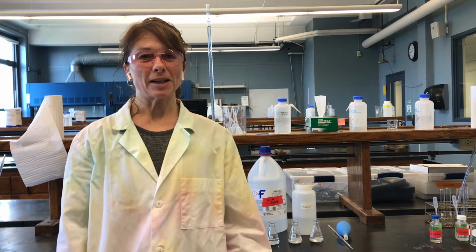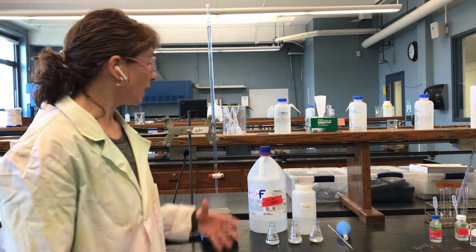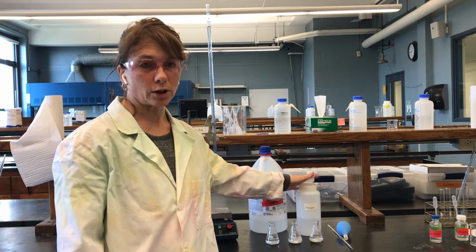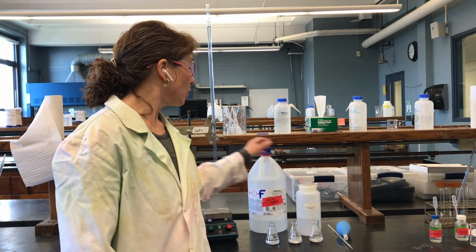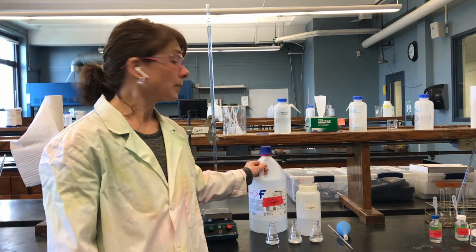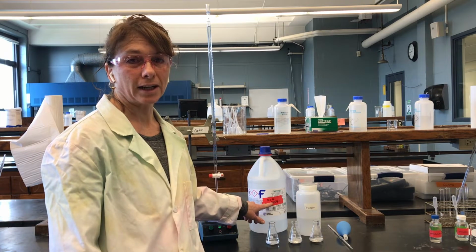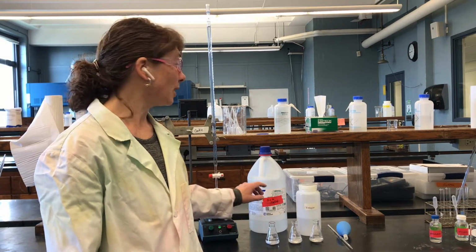So I know I've already explained the general concept of a titration, but just again, what we're going to be doing is we have our analyte. This is our vinegar. The vinegar is the thing that we don't know the concentration of. We don't know the concentration of acetic acid. We want to figure it out. So we're going to figure it out using a titrant, something that we know the concentration of exactly. In this case, it's sodium hydroxide. I'm telling you it's about 0.1 molar. You'll be able to calculate that exactly in the calculation section. So we're using 0.1 molar sodium hydroxide.